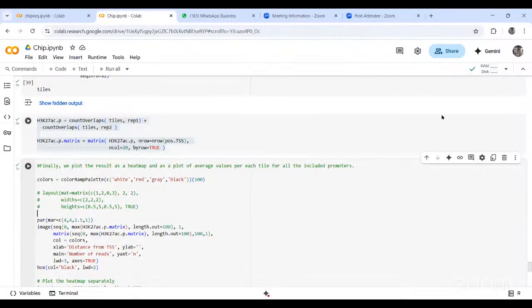Okay. So I concluded this part. In the next class, I will help you prepare the data set, and that we have to do in Linux. We have to import the data because, as I told you, I have used data from some other sources.